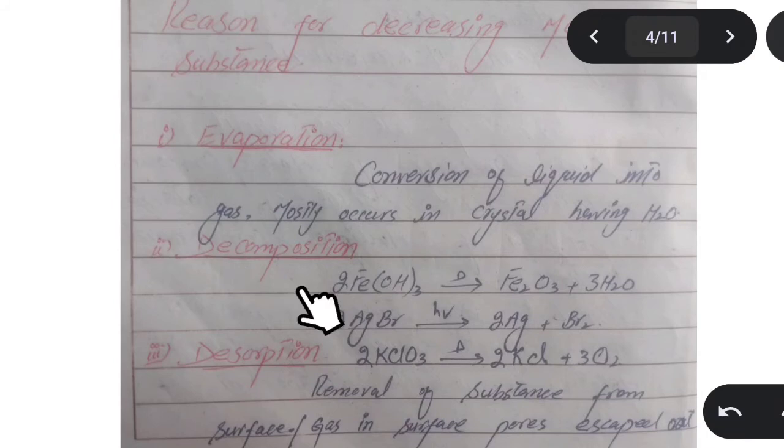Decomposition: when a salt like calcium carbonate, CaCO3, is decomposed, it forms calcium oxide and carbon dioxide. As we know, carbon dioxide is a gas, so it will leave this mixture. Similar is the case with iron hydroxide: when I heat up the iron hydroxide, it changes into ferric oxide and vaporous water molecules, and these water molecules leave the container because they are present in the form of gas.